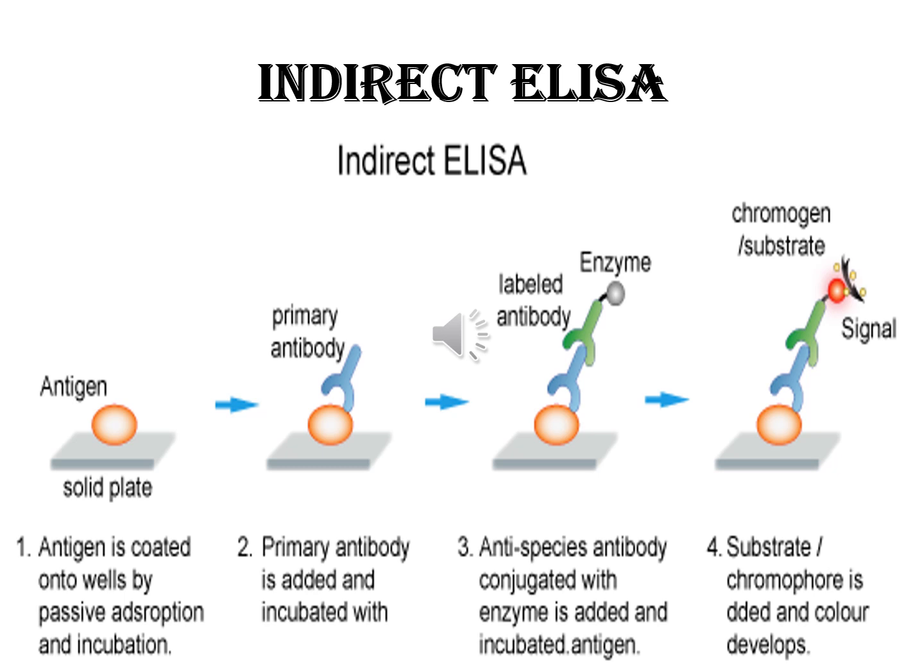Any free secondary antibody is washed away and the substrate for the enzyme is added. The amount of colored reaction product that forms is measured by a specialized spectrophotometric plate reader, which can measure the absorbance of all the wells of a 96-well plate in seconds. Indirect ELISA detects the presence of serum antibodies against human immunodeficiency virus.